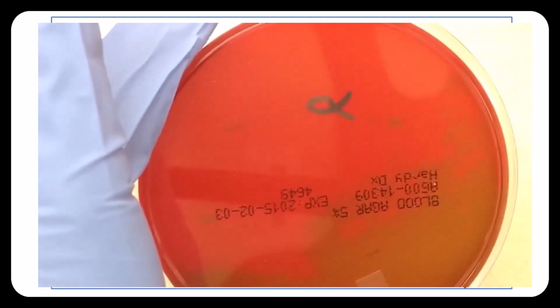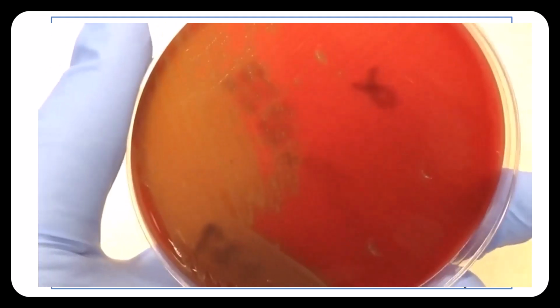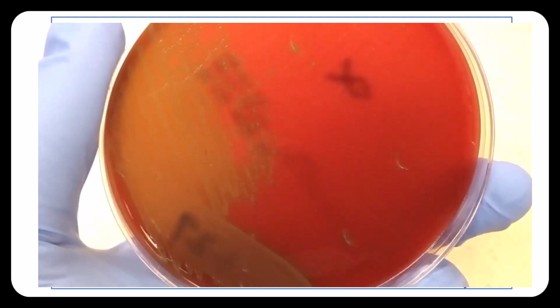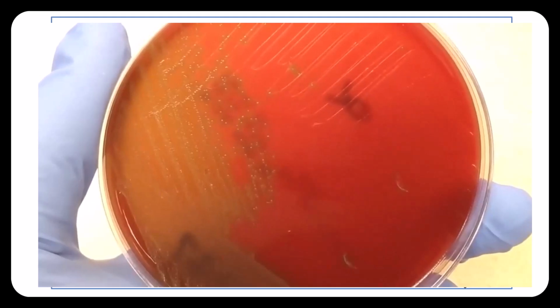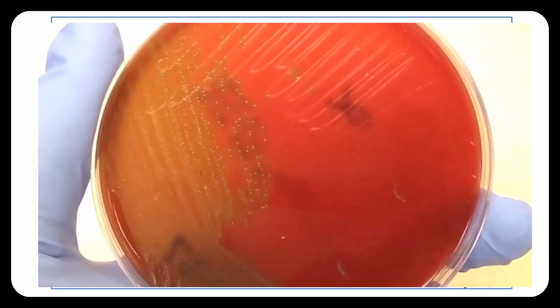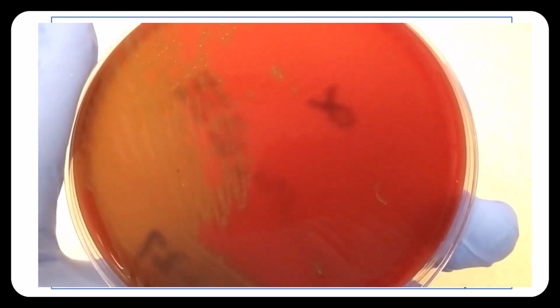Today in this video, I'm going to show you the three types of hemolysis on blood agar and the difference between them. Okay, the first one here is alpha hemolytic Streptococcus pneumoniae. You can see here a green zone around the colony, that is alpha hemolytic, which is due to the partial destruction of the red blood cells on blood agar. This is after the streaking method, with the plate incubated with increased CO2. You can see after 24-hour incubation the green zone around the colony, which indicates the alpha hemolysis on blood agar.